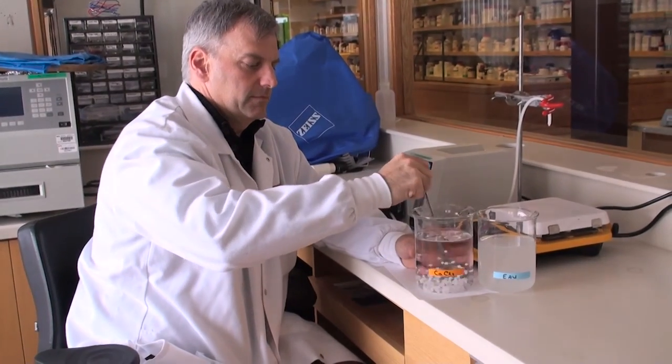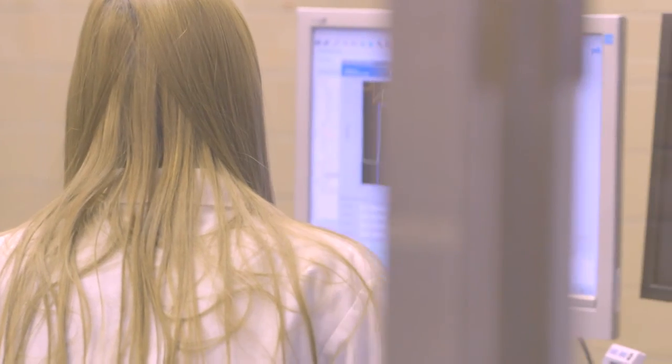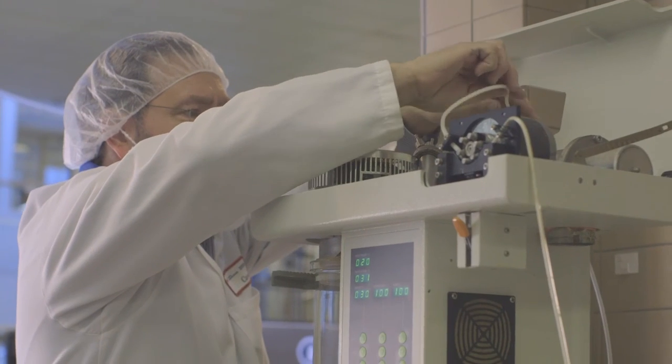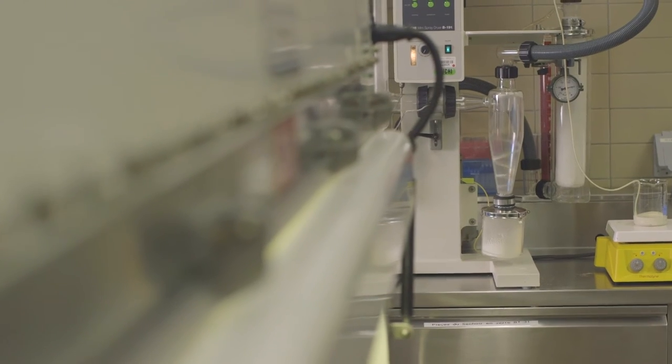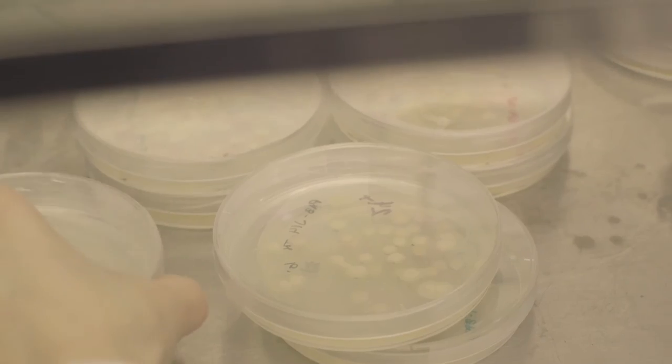And to simplify what we can do, we can conduct tests using in vitro conditions. We will start by testing these hundreds of conditions and then narrow it down to a few of the best conditions, which we can then test on humans.